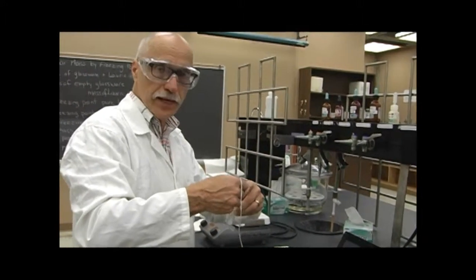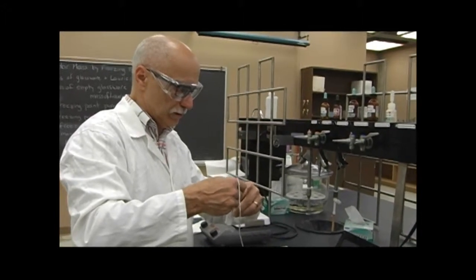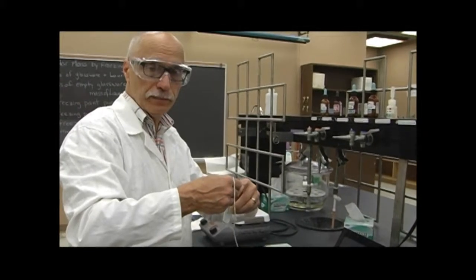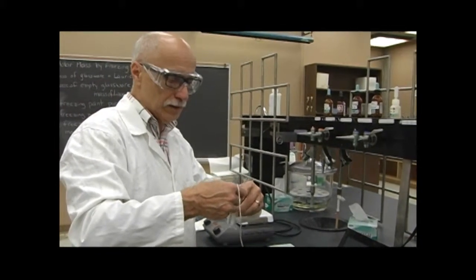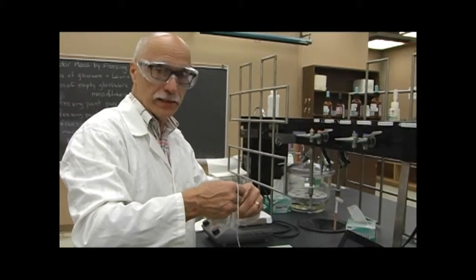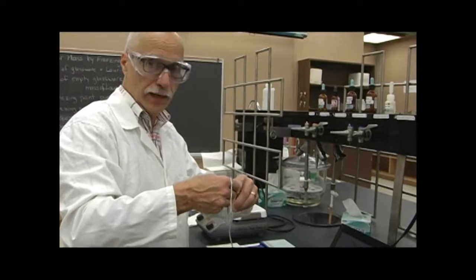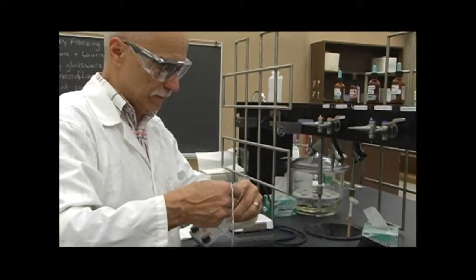So the important thing is that we keep it steady for a good few minutes so that we know what the freezing point is to begin with. And then, as I mentioned, we're just concerned about how much lower it's going to be because of the equation delta TF: the change in freezing point is equal to a constant times the molality of the solution.